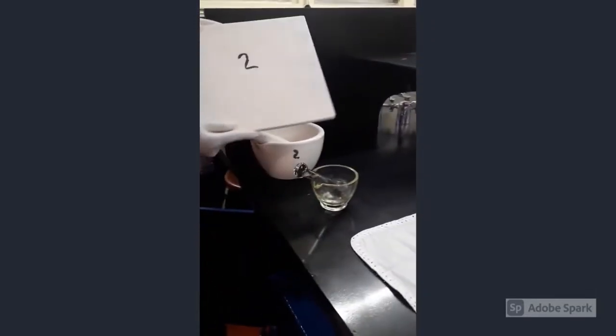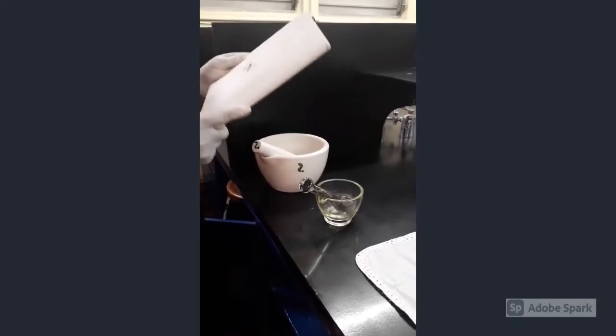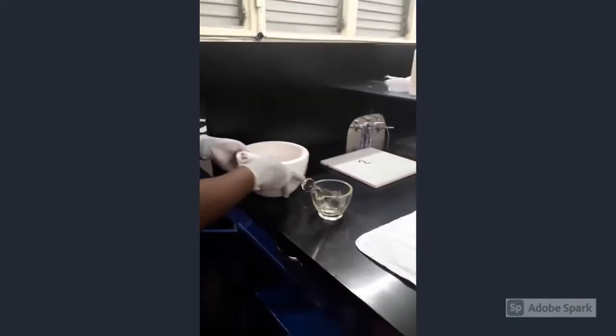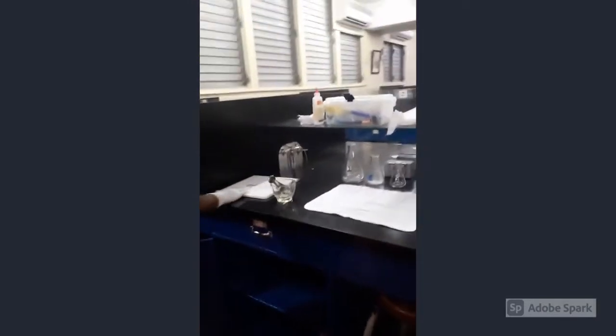Your ointment tile. There are some that will be porcelain and some that will be glass. She's putting them back in the cupboard.